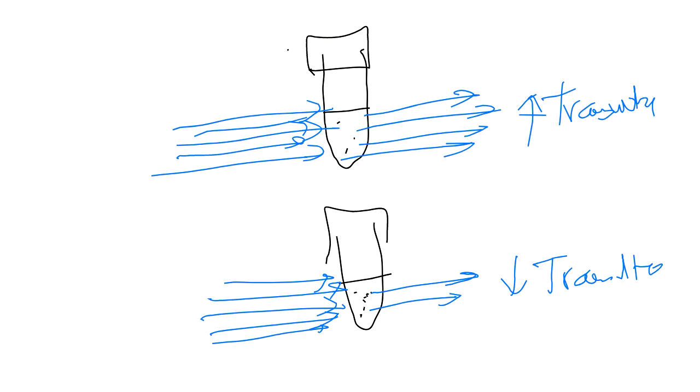One of the problems with this method, even though it's very, very good, is that it is an indirect method, and you're accounting for dead and live bacteria. A dead bacteria will still absorb light. So you're getting numbers that are a little bit skewed because you're getting numbers for both live and dead bacteria.